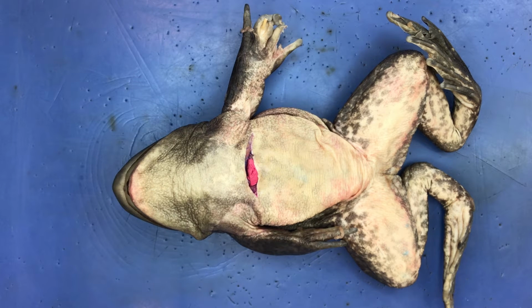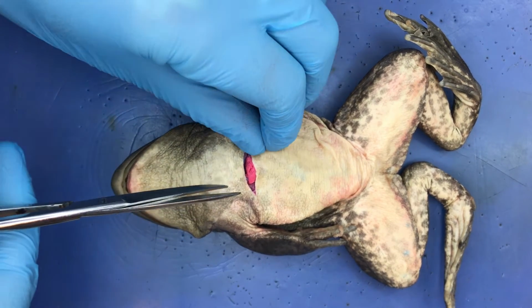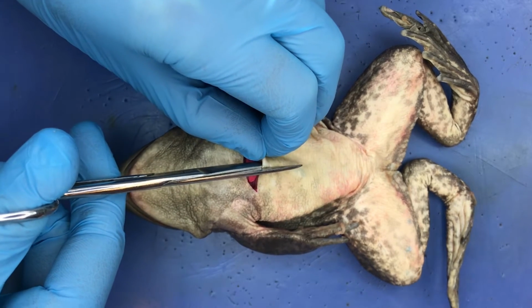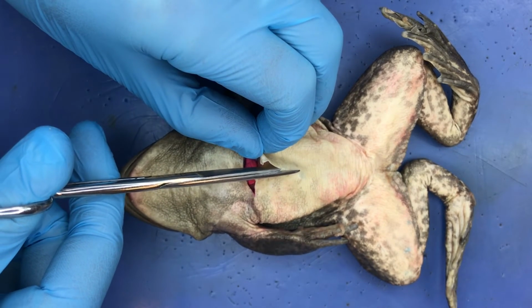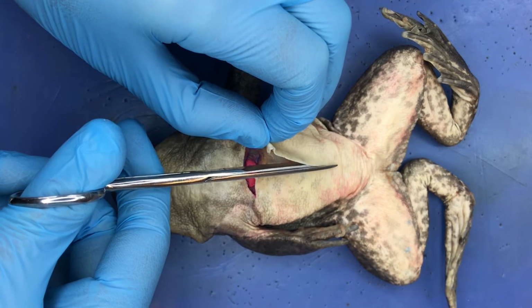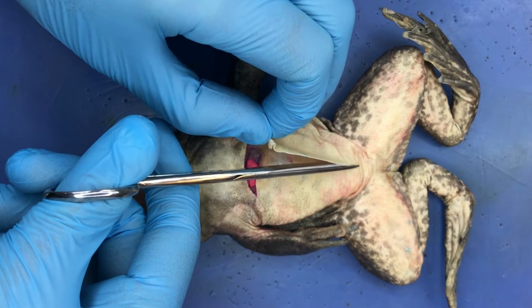To expose the internal anatomy within the trunk of the frog, we will make a midline incision with a pair of scissors. The incision will begin in the center of the abdominal region and cut to the transverse fold of skin separating the trunk and hind quarters.